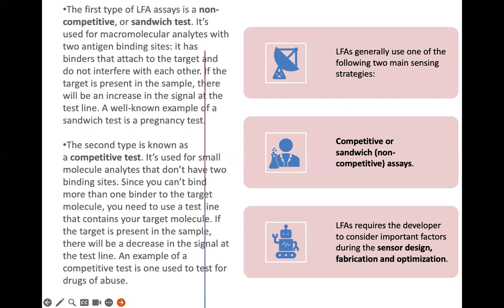So a bit on fundamentals, because as I mentioned, I do not know your background. Sometimes we can use competitive assay or non-competitive assay. Tomorrow you will be exposed to non-competitive assay. We have not done any competitive assay.